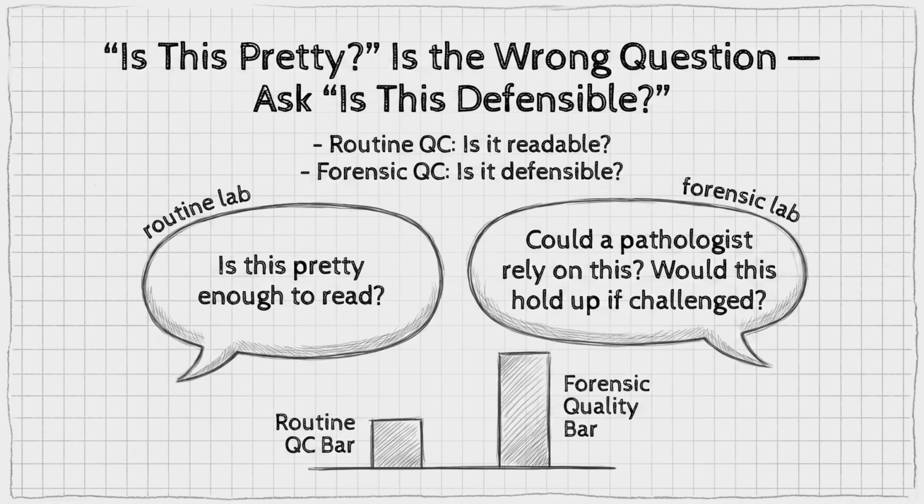Following on from recognizing artifacts, this slide really drives home the core question you should be asking yourself. It's not about whether a slide looks pretty in a general sense. It's about whether it's defensible in a court of law or to a critical medical examiner. A perfectly stained slide with a fold through a critical area is not defensible. A slide with floaters that obscure a lesion is not defensible.